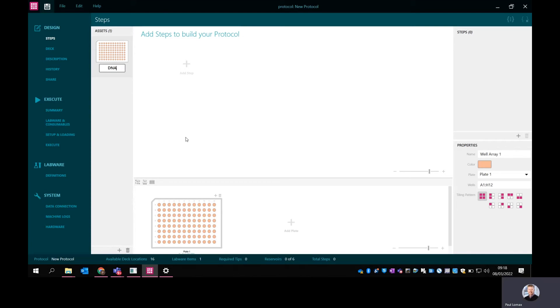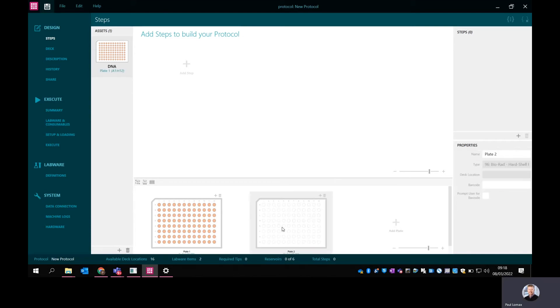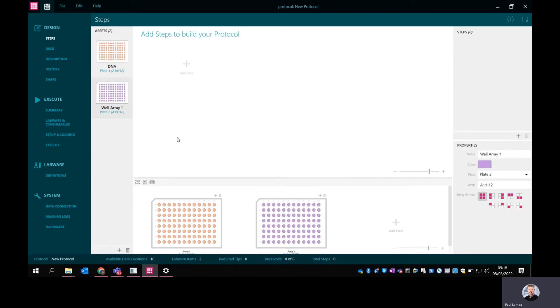I'm going to add a second plate, again using the same Bio-Rad 96. I'm going to select the whole plate and this one I'm going to call my cleanup plate. You don't have to name them, but it just makes it easier to track things as you build the protocol.